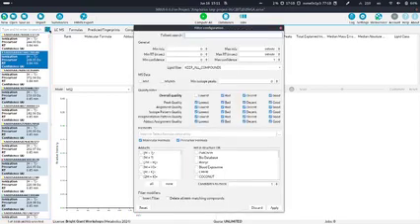And then in the adduct or the database, if you don't click anything, it means they're already included, am I correct? Yeah. So this is filtering, meaning that now everything is included without any boxes ticked. Exactly. I will also show an example soon of how you can utilize this, for example, for adducts or for structure databases.